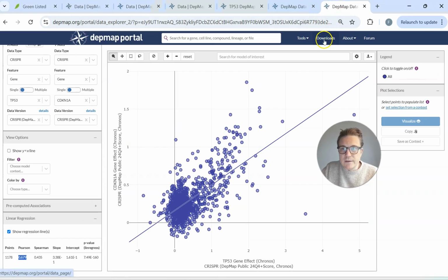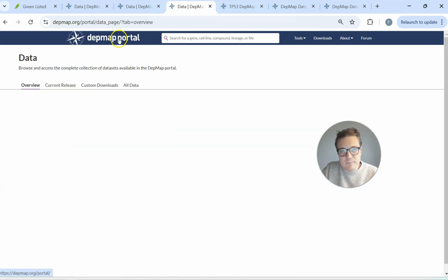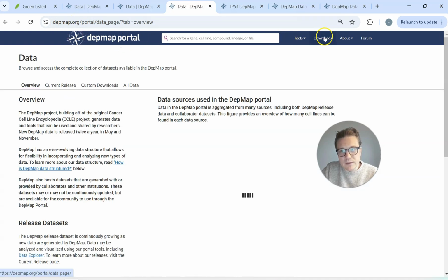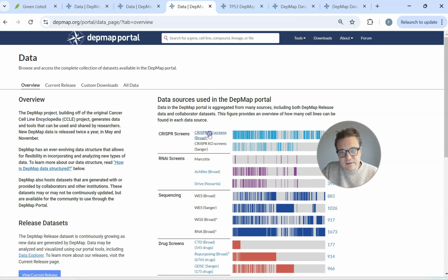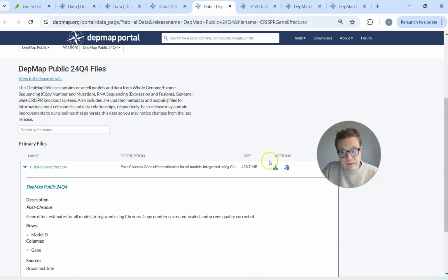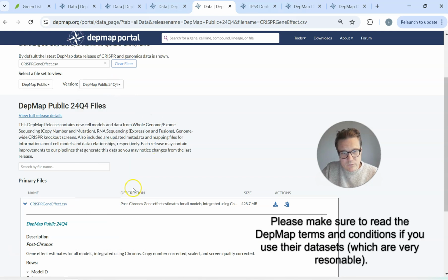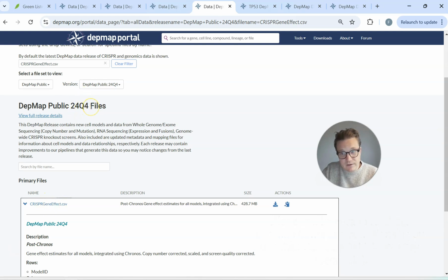That you can do here. You want to go to the downloads at DepMap, so depmap.org, and then go to downloads. It's the CRISPR screen data you want to go for, and then it's the way it looks now, which is February 2025, and there's a download file here of the most current version. Note that there are different versions of their datasets, so although the name of the file you download is not indicating that it's 24Q4, I would call it that just for your own sake.